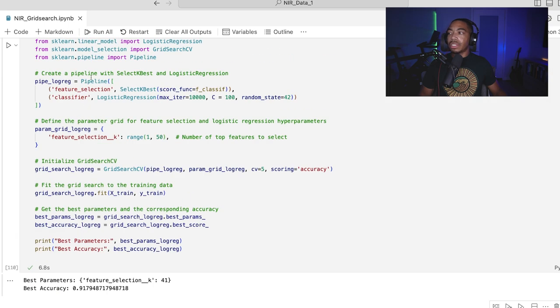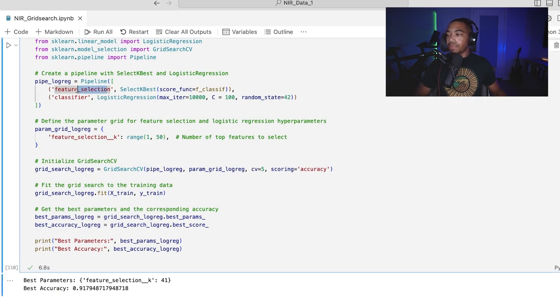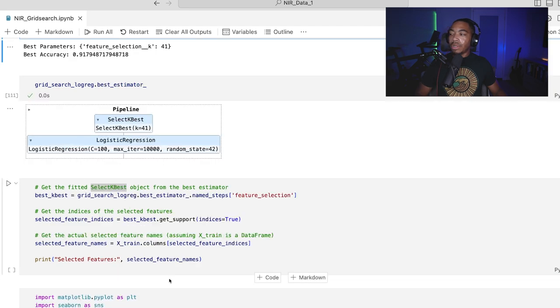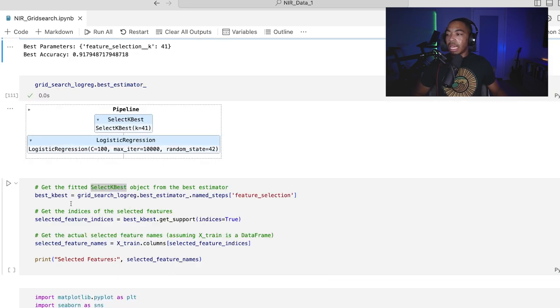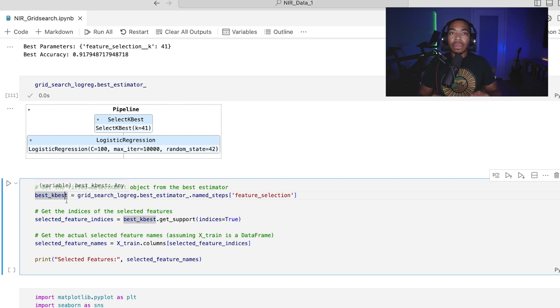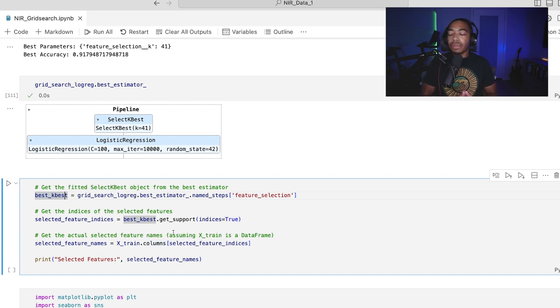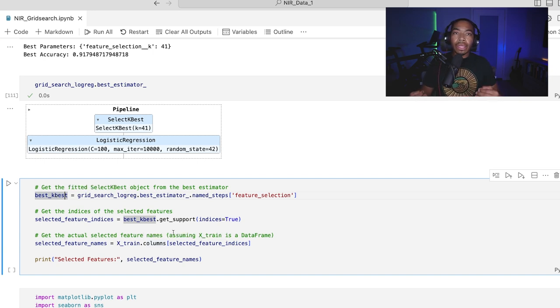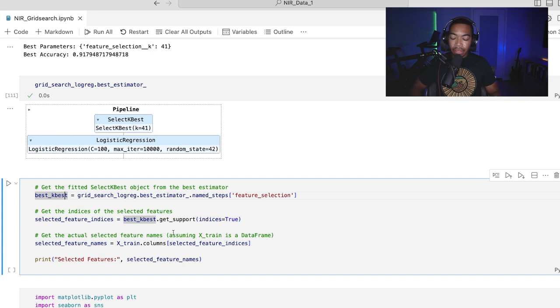So this is the feature selection and the SelectKBest. And what I want to do is create this object, this best k best here, so that we can then figure out what those index values are, those column indices, so that we can filter the original data set and create a way to visualize the impact of this feature selection process.